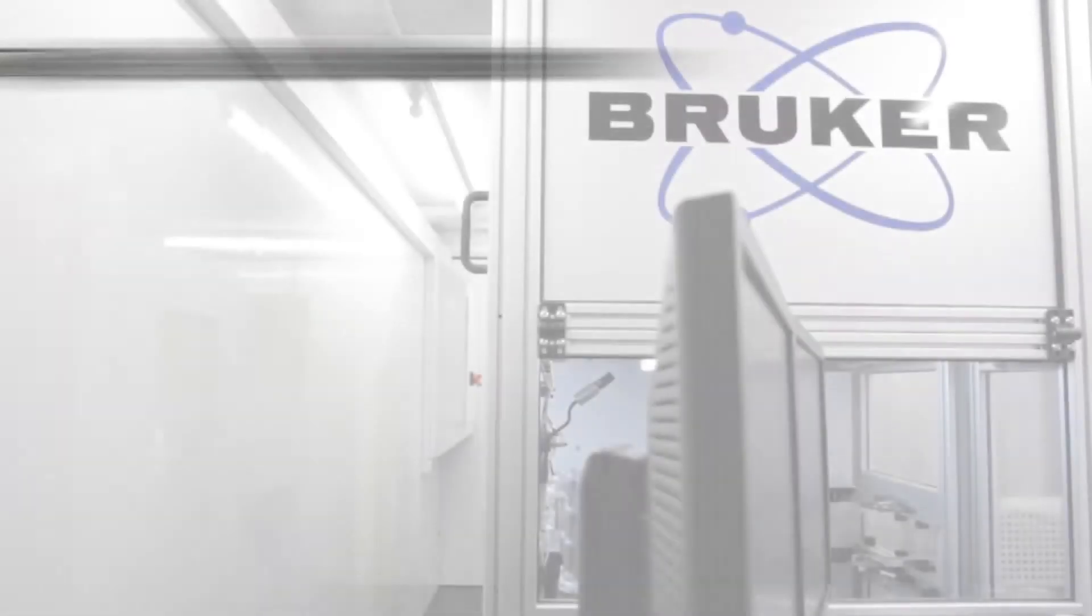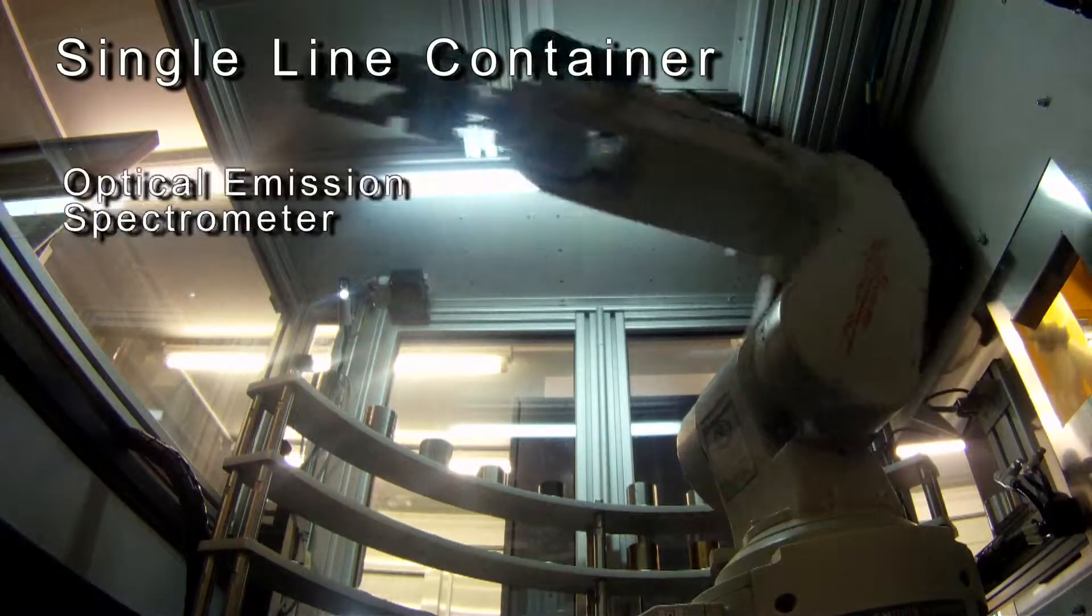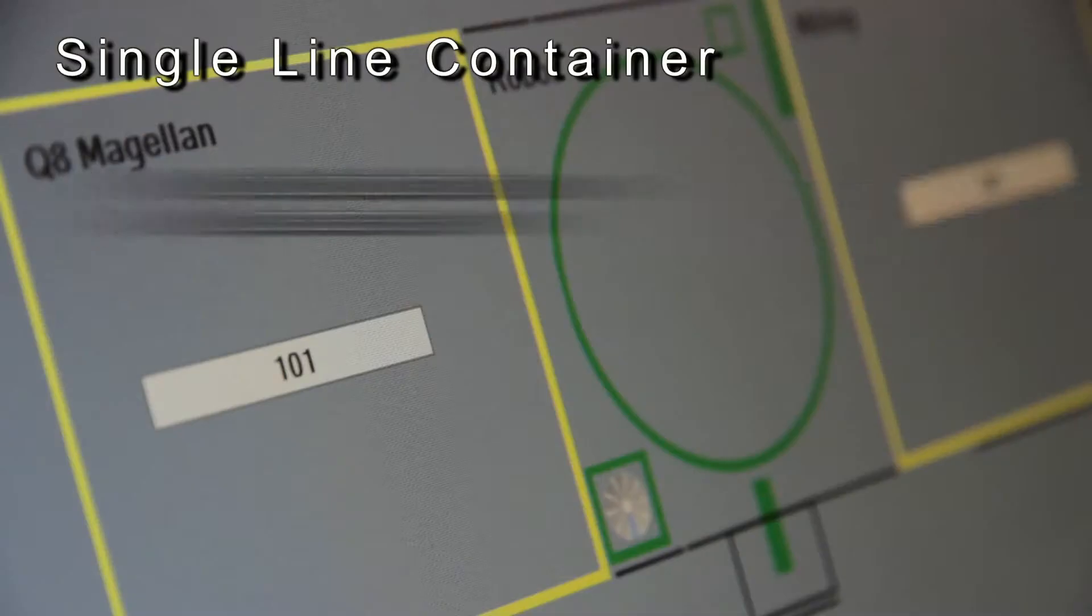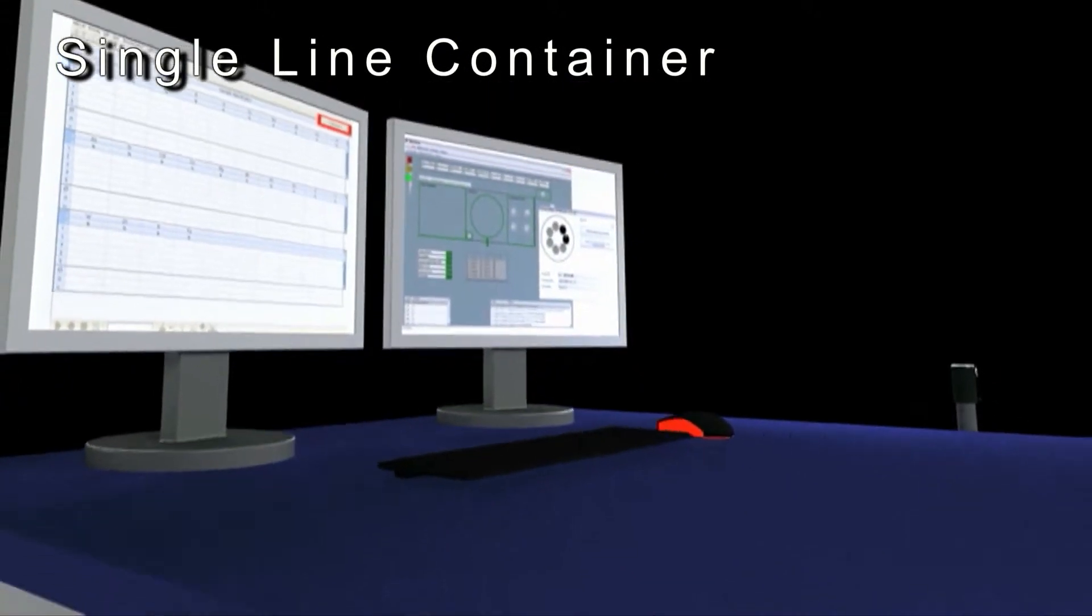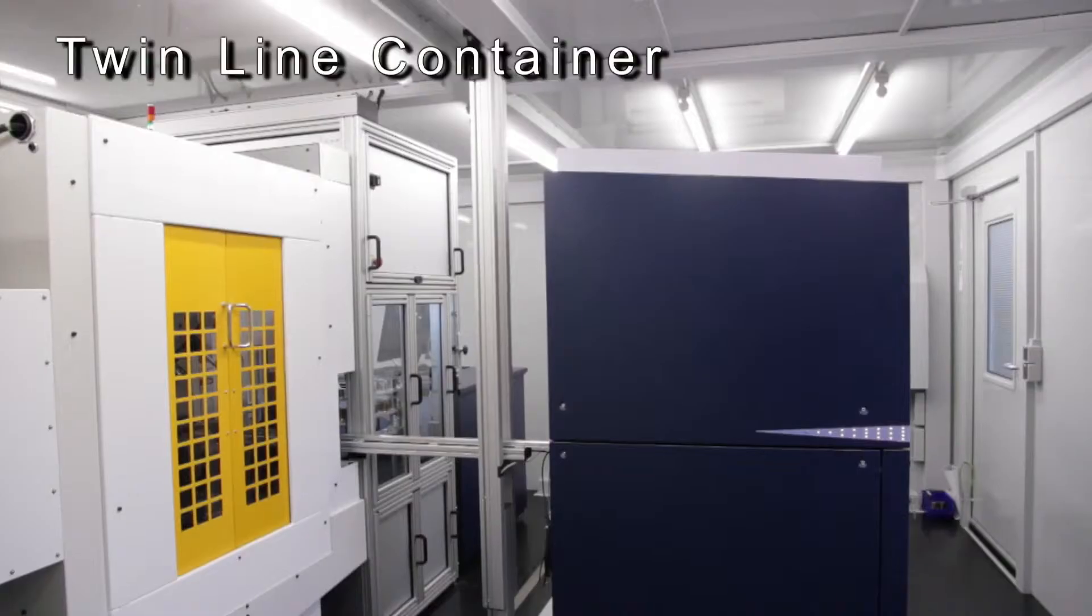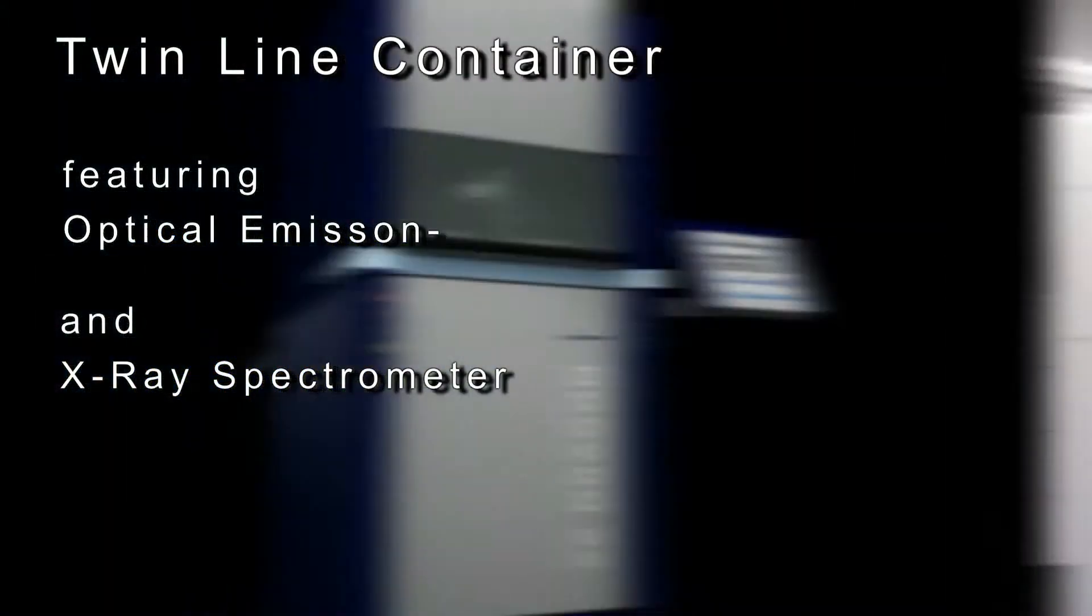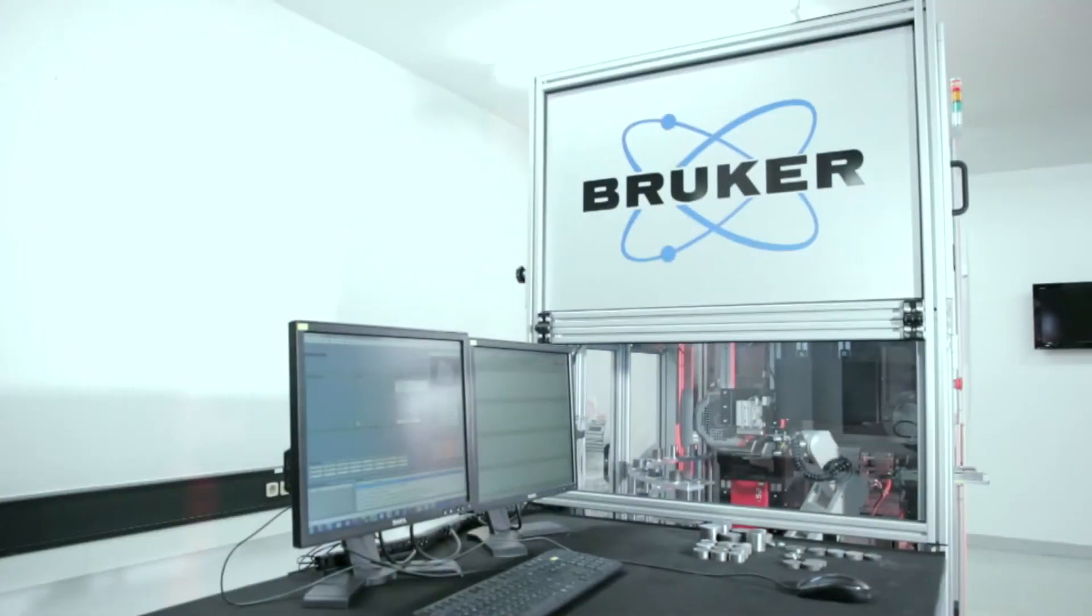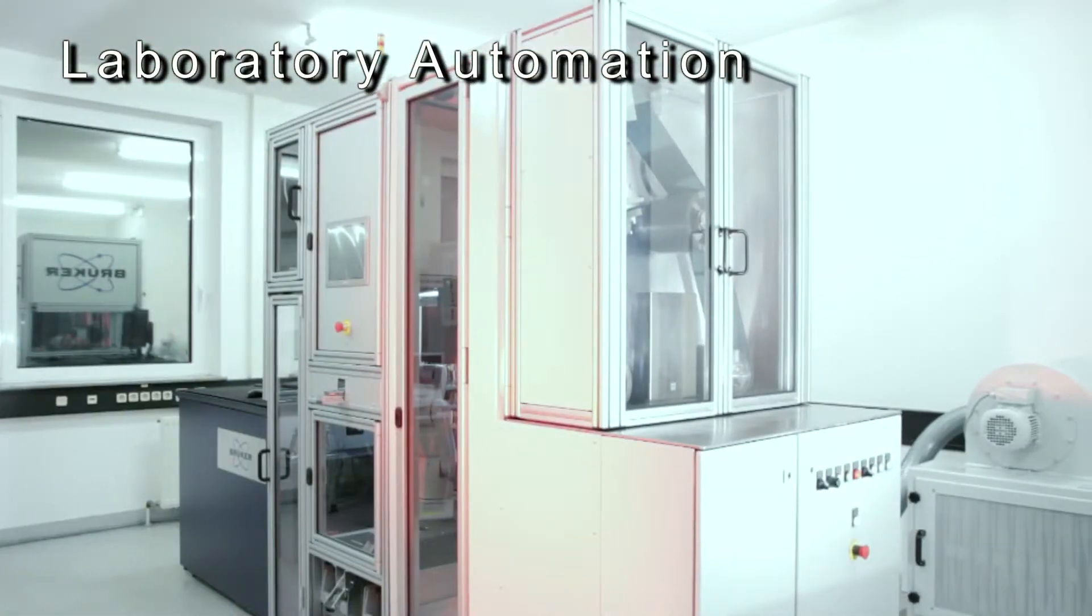The setup of the analysis automation is possible in a single line container with optical emission spectrometer, or a twin line system featuring optical emission and X-ray spectrometer, or as a laboratory automation to fit into existing room space.